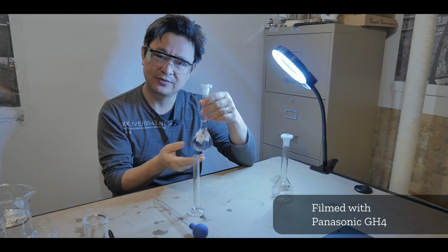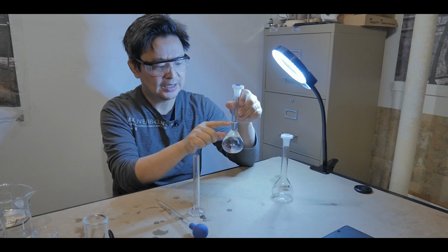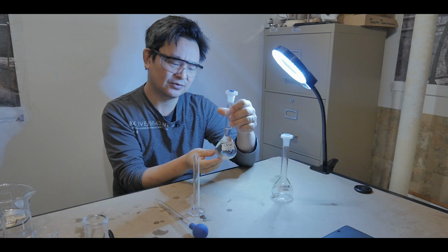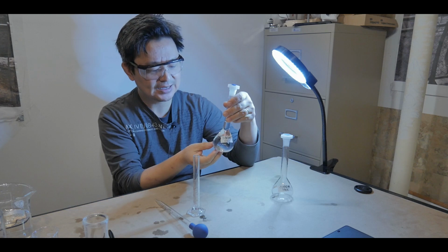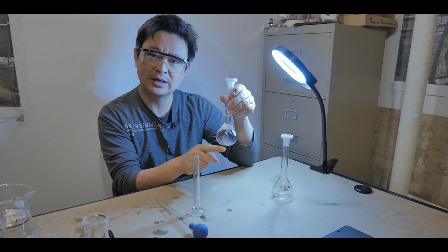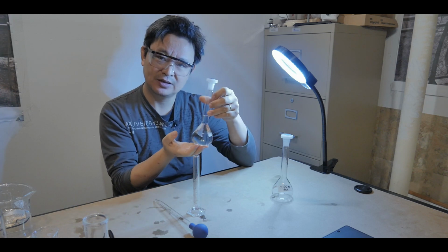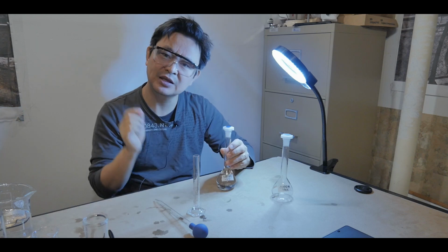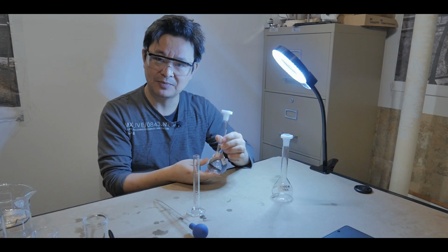Now you would need a volumetric flask because they're very precise. They have a marking here and it will tell you exactly how much volume you have. So this volumetric flask is pretty precise, to say 100 mils plus or minus 0.1 milliliter at 20 degrees Celsius. So very accurate instrument. If you're thinking about making more accurate serial dilution, you need to invest in a volumetric flask.